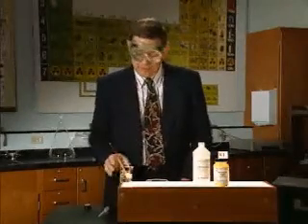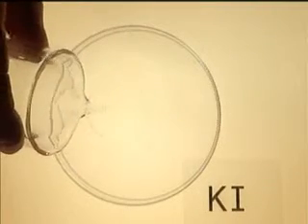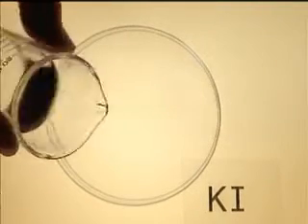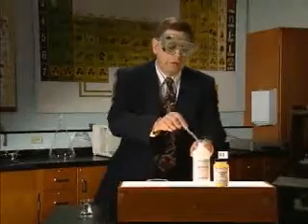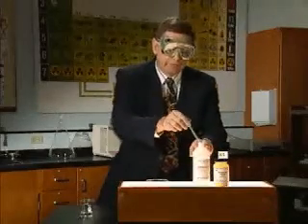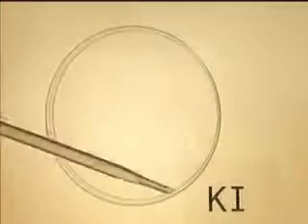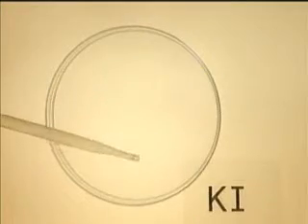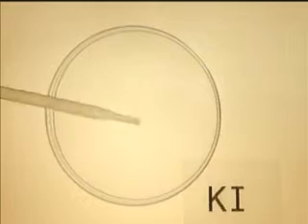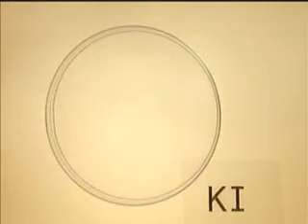To demonstrate the electrolysis of potassium iodide, we have a potassium iodide solution which we'll place in the Petri dish. We'll then add a few drops of phenolphthalein indicator to the potassium iodide solution.